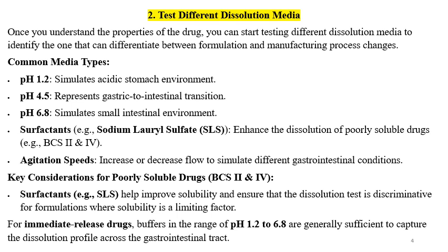Then coming to test different dissolution medias. So after knowing the BCS, solubility and dissolution pH of the API, we should go for the different medias.